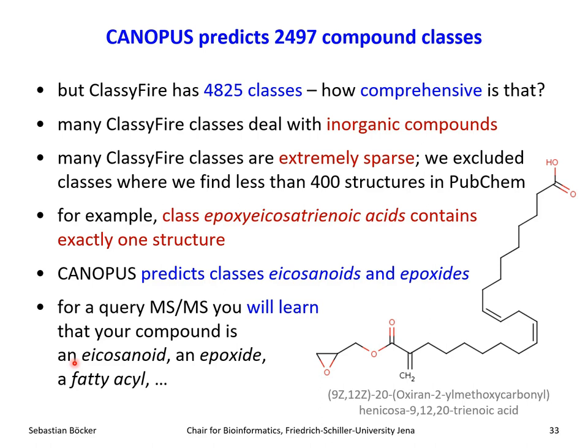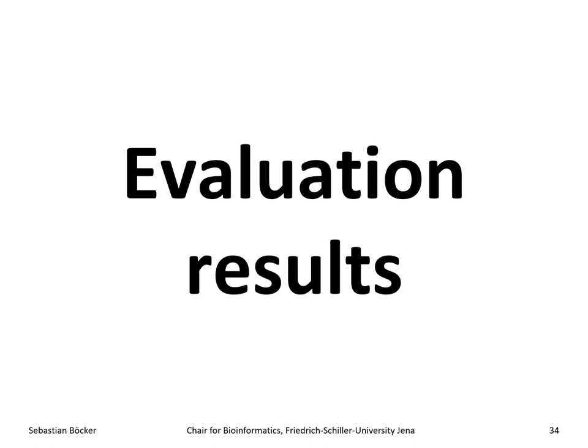They will be those where you make statistics for the biological cases, which I will show in a few seconds. Such a class is so small that if you compare samples and ask how many of those are in sample one compared to sample two, it will be zero in both cases. How interesting is that? And with that, we are already done with the method. And now I'll show you evaluation results.